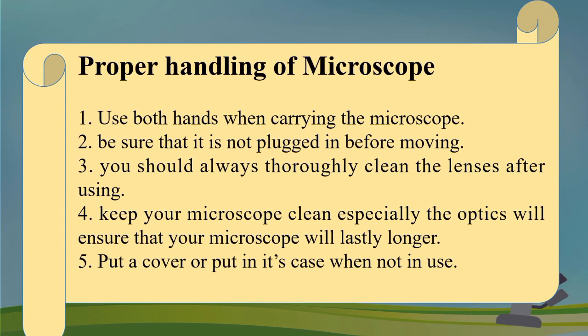Now that you know the parts and functions of the microscope, let us learn the proper handling. First, we should use both hands when carrying the microscope. Second, be sure that it is not plugged in before moving. Third, if using immersion oil, you should always thoroughly clean the lenses after use. Fourth, keep your microscope clean, especially the optics, to ensure that your microscope will last longer. Fifth, we should put a cover on it or put it in its case when not in use.